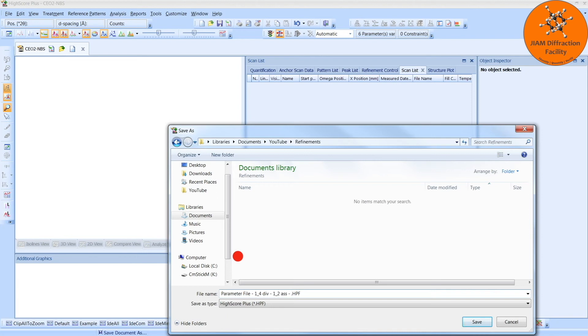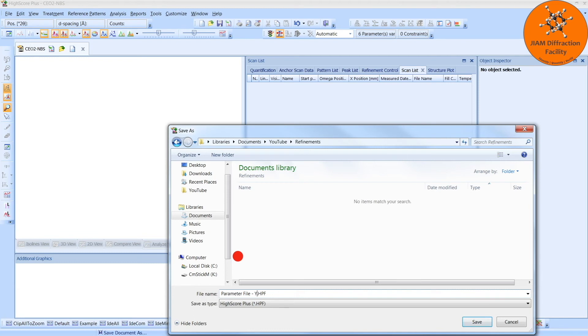because any time you change even a single optic, you need to go back and take your line profile standard, collect another diffraction pattern on it using the new optics, because any change in your optics will change your instrumental broadening. But I don't know what optics were used for this diffraction pattern, so I will just call this my parameter file for YouTube.